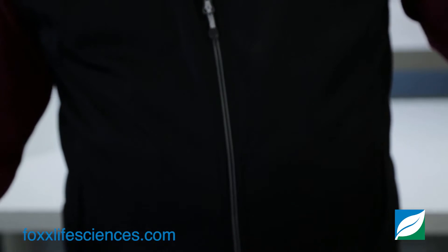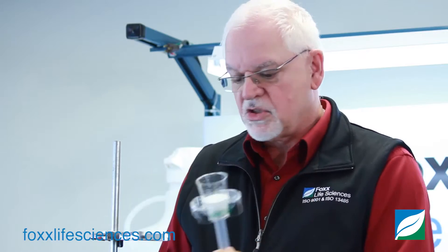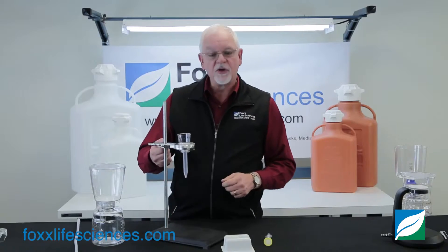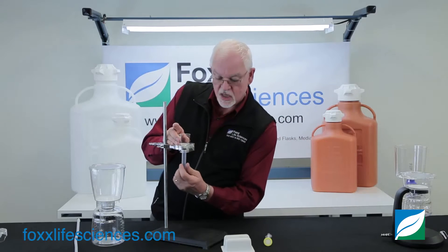So what we've done is we've created a 15 ml and a 50 ml unit. We are the only manufacturer in the world that has this product. You can actually use the vacuum — you pour in your fluid, you turn it on, it's done. When you're ready, you can just unscrew, put another one in, and keep filtering if you like.